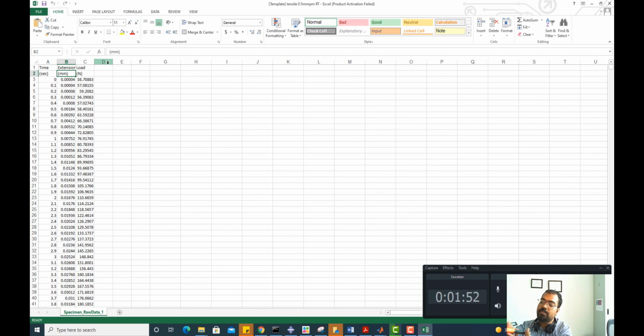So the two pins hold the specimen like this, and there is another pin which presses. You see there are 3 points, and this is why it is called 3-point bending. You can have 4-point bending also. In all those tests, you will get these data. In fatigue testing, you get these data too, but you also get something else which is different. So analyzing these data, what we are doing in the tensile test, can help you in many other tests.